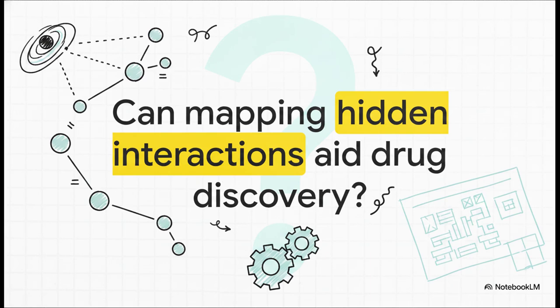So, as we wrap up this explainer, I really want to leave you with this thought. If we can decode the invisible language of atomic neighbors using such simple math, how might mapping these hidden interactions accelerate the discovery of tomorrow's life-saving drugs or revolutionary materials? We've gone from unseen spinning protons to predictable mathematical patterns, to invariant constants that tell us exactly how atoms are linked. By mastering these invisible neighborhood maps, we aren't just looking at chemicals, we're literally reading the blueprints of nature itself.